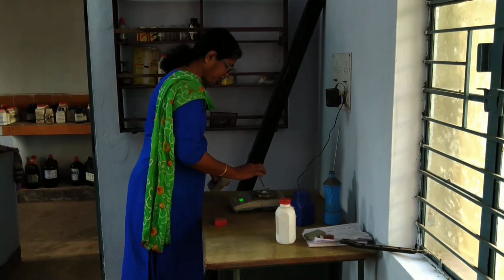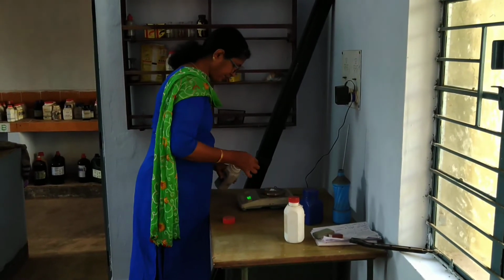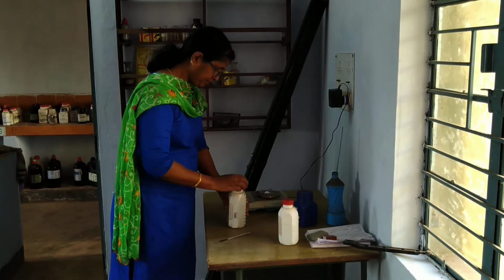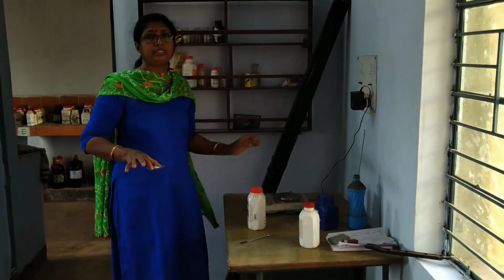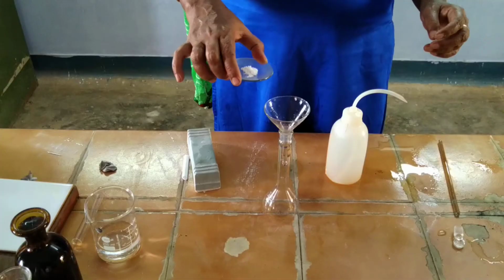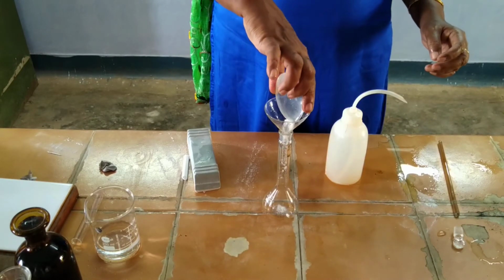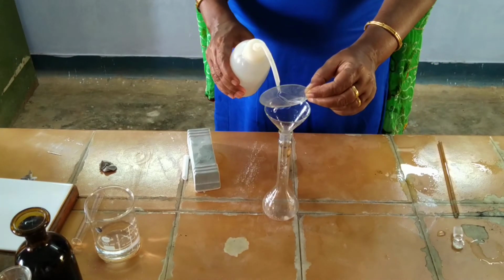It's very simple, not that problematic. You can simply make 0.63. Okay, 0.63 you got. Now you will have to transfer it to the standard flask. This is 0.63 gram. So we are going to prepare the standard solution and transfer it. Then you wash it with water.